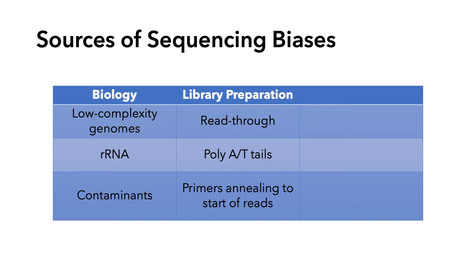The second source of sequencing bias is library preparation. Read-through occurs when the insert size is shorter than the sequence length, so the sequence reads through to the adapter. Poly-A tails can be left over from library prep — these are problematic because they can create links between totally unrelated sequences, generating chimeras. In RNA-seq especially, primers can anneal to the start of the reads during library preparation.